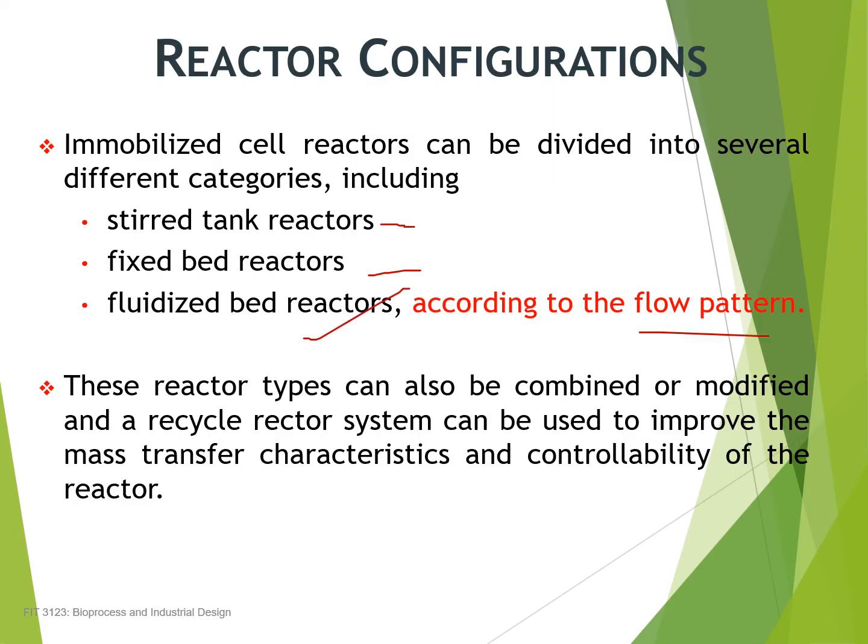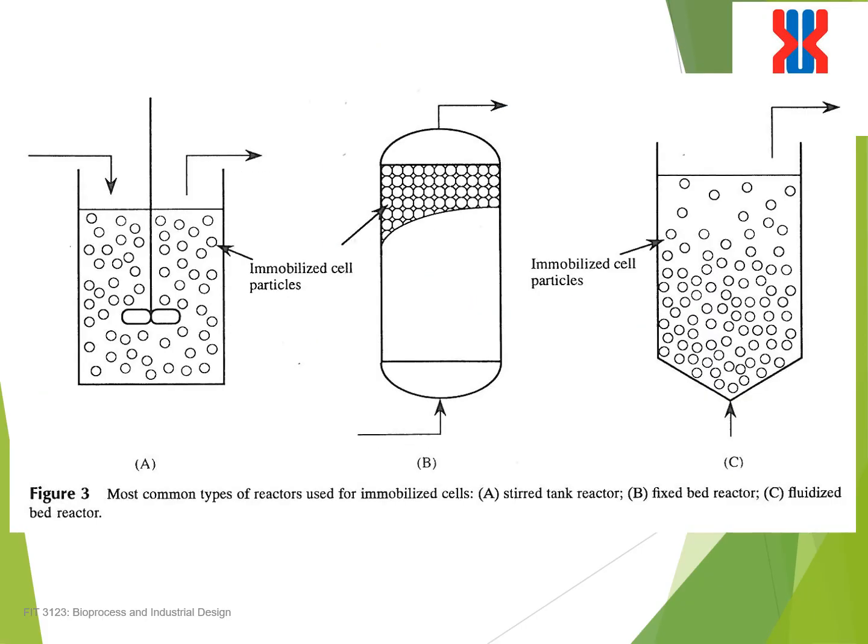Fluidized bed is actually based on the pattern. The tank, of course, you have the impeller. Fixed bed means that you fix the bed, either at the bottom of your bioreactor or at the top. Okay, so this is an example.